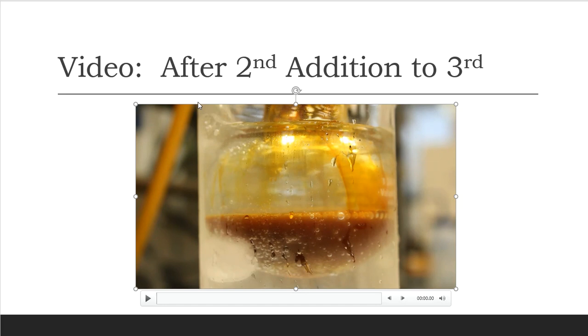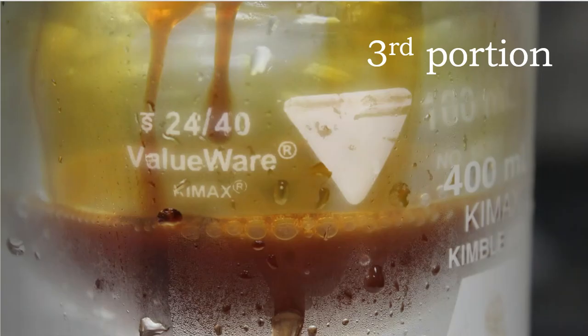Okay, so that was my boiling flask. That was between my second and third addition. My second addition is in here. It never lightened up. I'm getting ready to go on to my third, and I ain't waiting, folks, and I know that you don't want to wait anymore either. So we go to the third portion. The third portion is going to happen at 2:37 p.m., and at 2:37, I add another portion of iodine and THF.